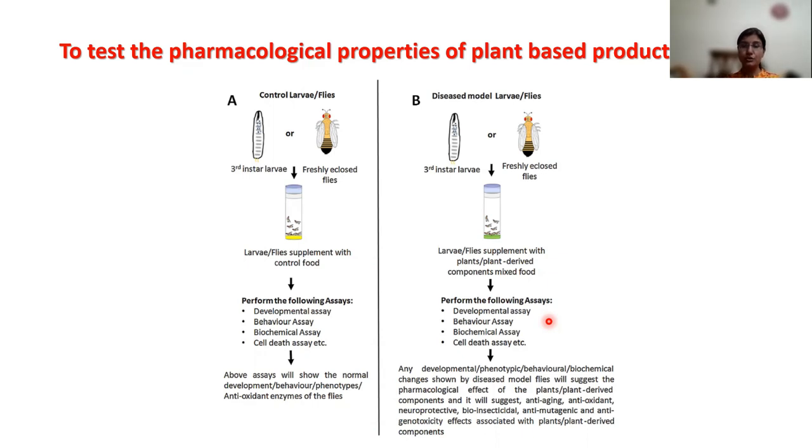Now we come to the behavioral assay. Feeding and gustatory behavior assays are very important because these assays have a proper signaling and molecular mechanism which can be correlated with the feeding behavior of the flies. Feeding the plant extract with a mixed diet is a very simple and effortless process. We can easily do it.